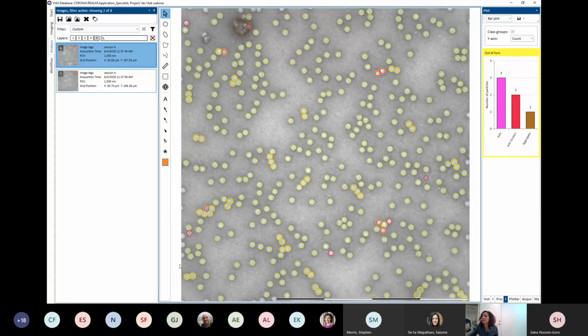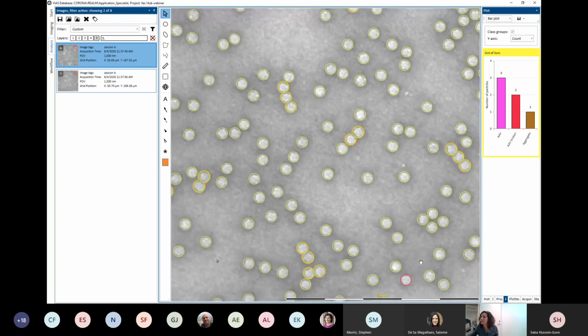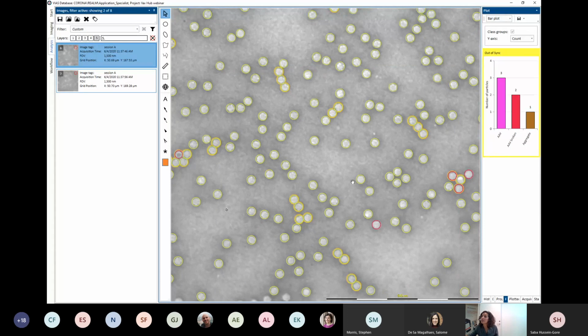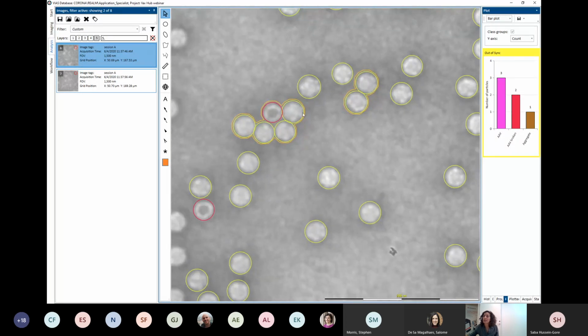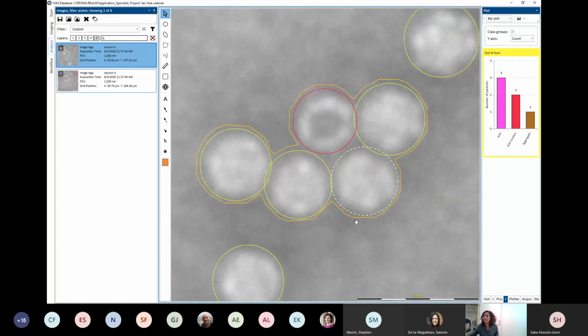But we're seeing that it's actually picked up most of the particles. It ignores these ones here if it doesn't see the full one. The ones here in the edges are actually removed. You can have a look at what it has classified as internally stained, and that is also something that we can adjust. So here it felt like this was internally stained. Maybe that's slightly on the pessimistic side, and we can change this threshold in the pixels. So here, for example, we have a cluster of 4 intact particles and 1 broken particle.